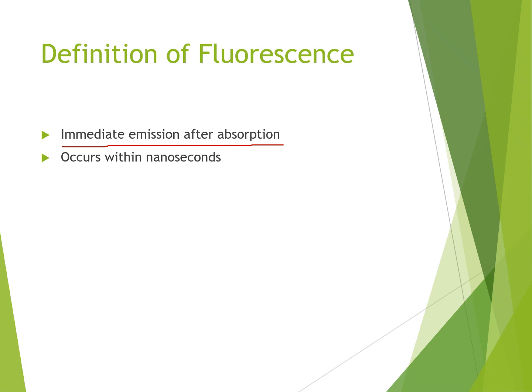In fluorescence, this emission is immediate. It takes place within nanoseconds, a very immediate process.